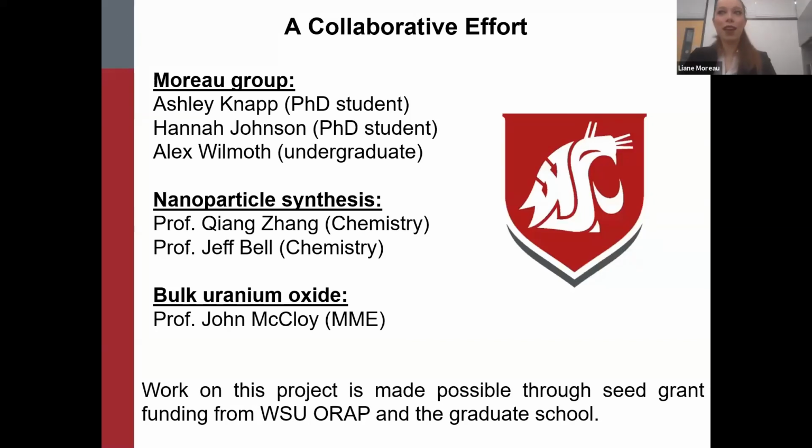Right, that's true. There's going to be a combination of radial structure having things to do with the properties as well as the electronic structure. Electronic structure wise, at least for the uranium oxides, going to more of the high energy resolution fluorescence detection, I think would give us some good picture on what that looks like, as well as we like to use magnetism, so SQUID magnetometry, to look at differences in the electronic structure of these different constructs. So those are not things I talked about within this talk, but are definitely things that we are planning to do in the future as we move forward with these systems.